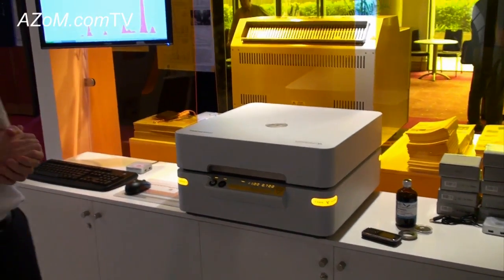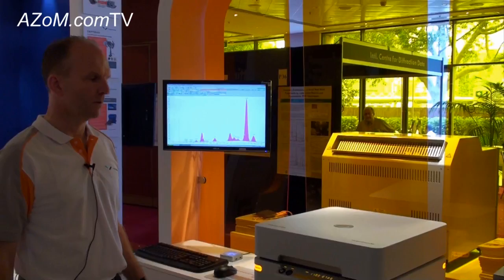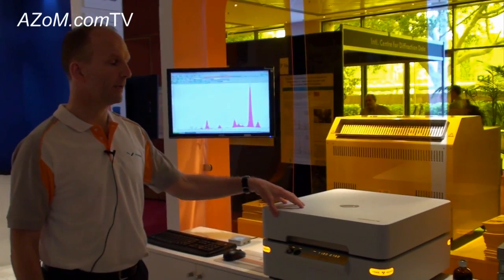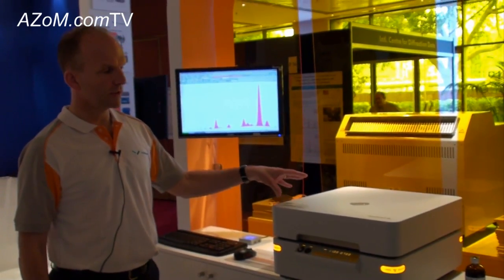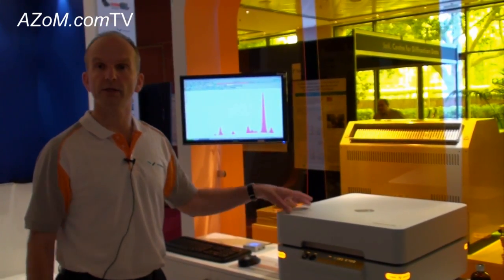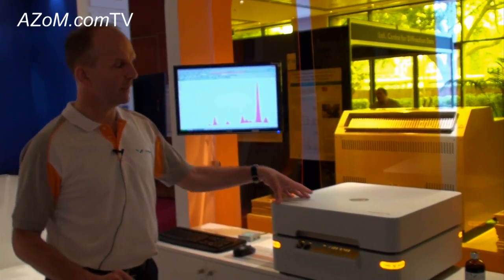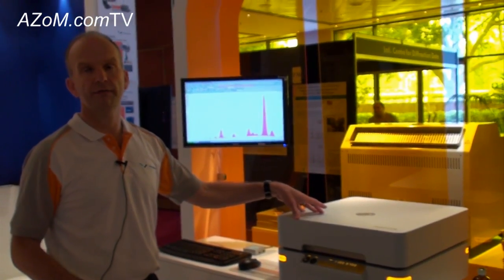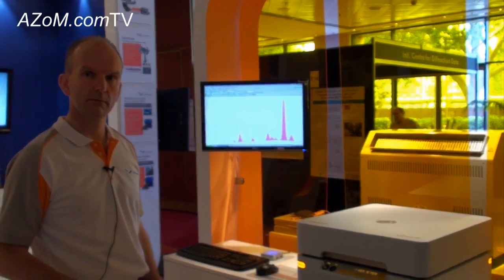What's the difference between this type of instrument — a small benchtop unit — and a larger stand-alone type instrument, as far as resolution and accuracy is concerned? The throughput of the benchtop systems tends to be lower. But we have made great strides in the performance of these benchtop systems, such that they are actually challenging some of the performances of some of the larger wavelength dispersive floor-standing systems. It does not outperform our Axios range of spectrometers, but this technology has made great strides in the last 15 to 20 years. So the accuracy is almost comparable but at a much lower price point — that's correct, yes.